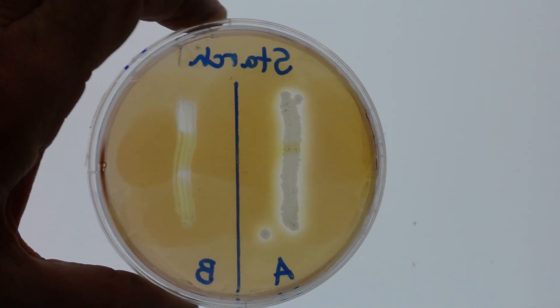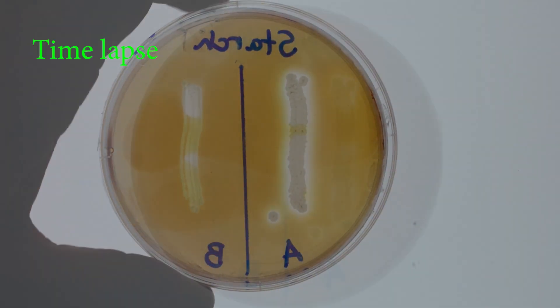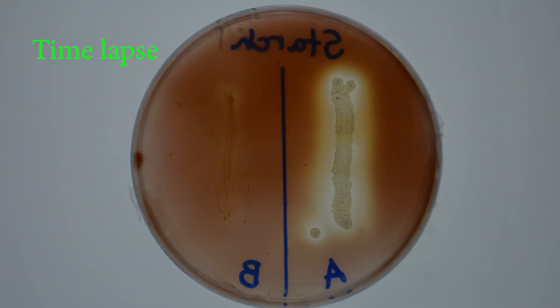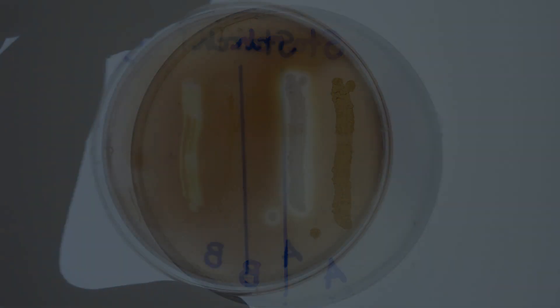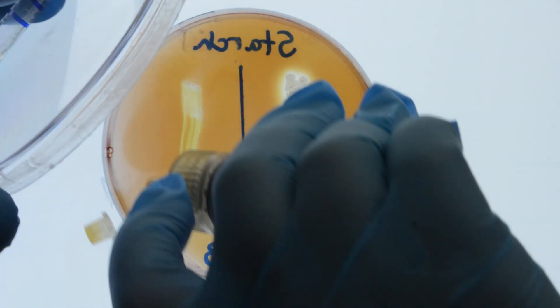Depending on the composition of the iodine solution used. An interesting fact about this is that the iodine is volatile and will sublimate, becoming a gas. After about 15 minutes, the plate color will begin to fade. If you reapply the iodine, you will see the reaction again.